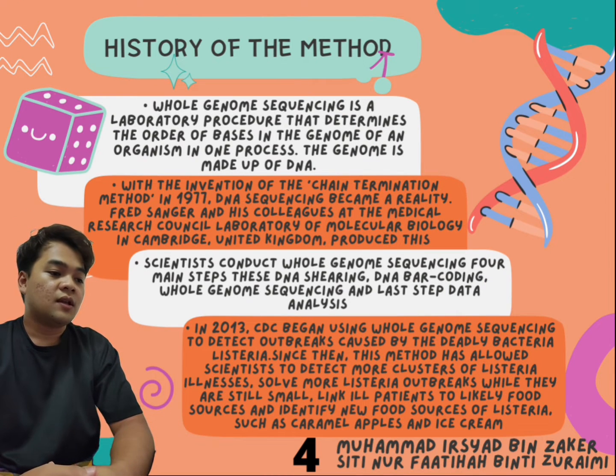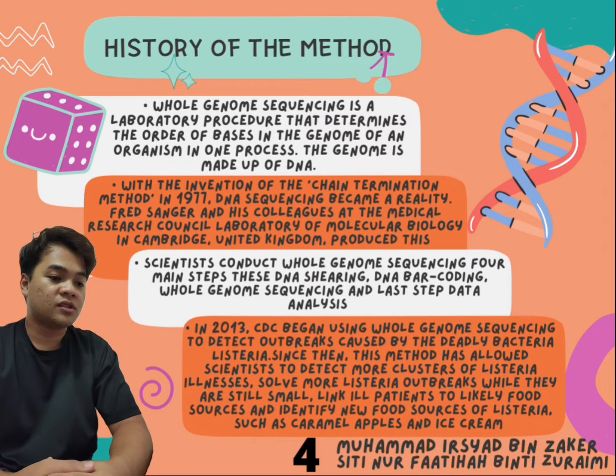The genome, or genetic material, of any organism is made of DNA. Each organism has a unique DNA sequence, which is composed of bases. If you know the sequence of the bases in any organism, you have identified its unique DNA fingerprint or pattern. Determining the order of bases is called sequencing.